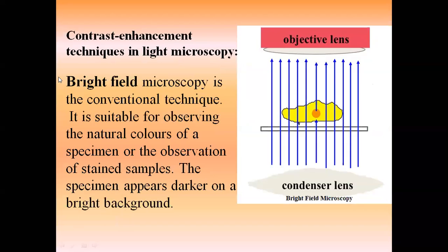So as the name says, a bright field. A bright field microscopy is the conventional technique. It is suitable for observing the natural colors of the specimen or the observation of a stained sample. The specimen appears darker on the bright background.